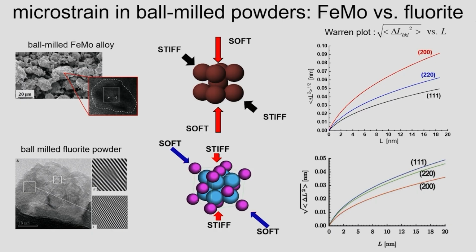Now, what use could you make of these results? Well, you see anisotropy, and I told you that the tangent to this graph is a strain. If you take the value at different positions, it will be related to the distance between atoms at that length. But if you extrapolate to zero distance, this is what we call true strain, which is something you can obtain from other techniques and from modeling. So what we can look at is this. You see the tangent in zero. This can be called true strain, and it's interesting.